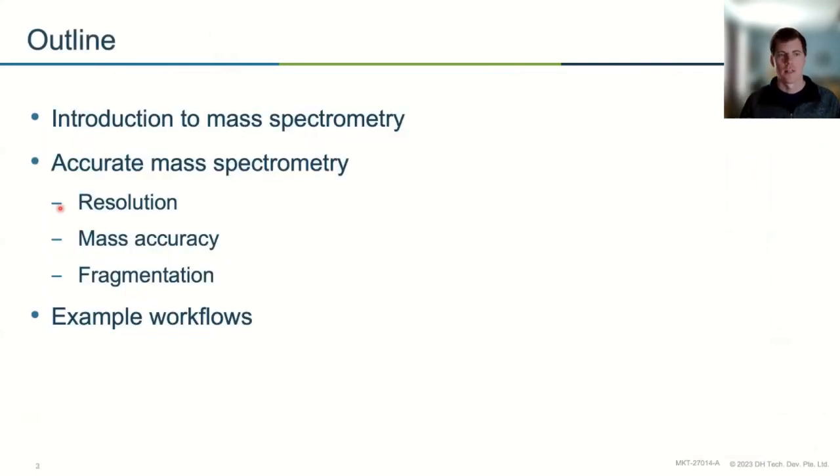So just getting started today, what we're going to look at is first an introduction to mass spectrometry and what it is. I'm going to talk about some of the basics that, if you're familiar with mass spectrometry, you've probably heard these terms before. It's always good to go back though and refresh yourself with how some of these things are calculated and why they're important in the first place, why we even care about them. And then at the end, we'll put it into the context of a realistic, actual workflow.